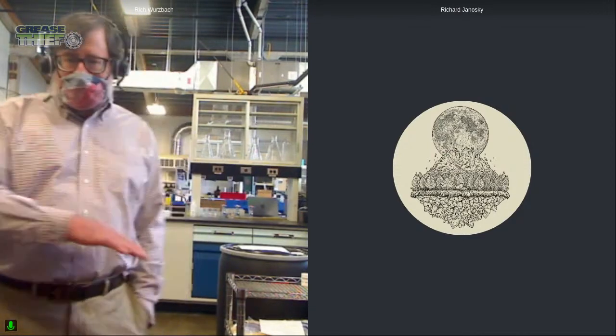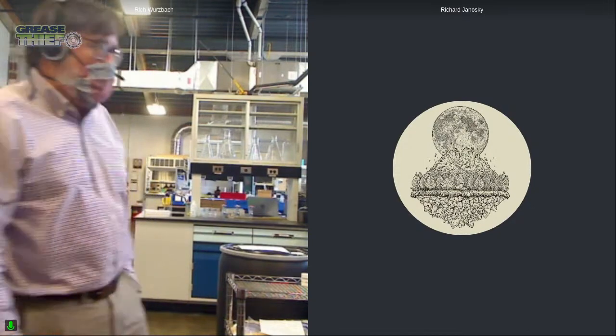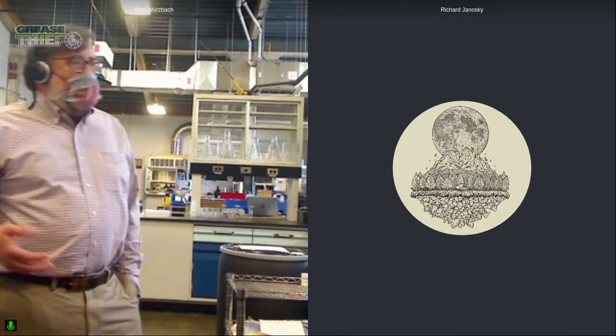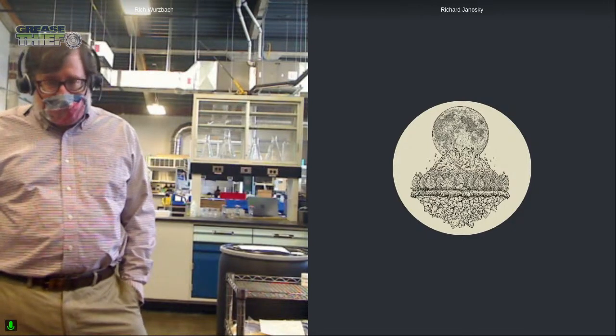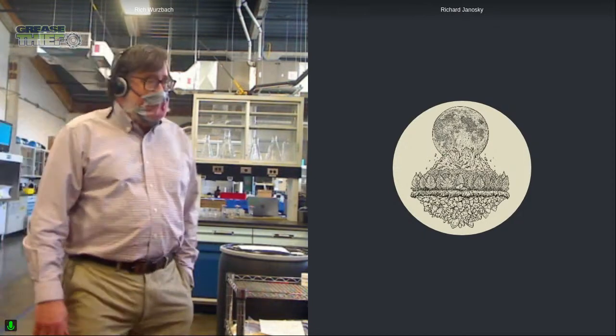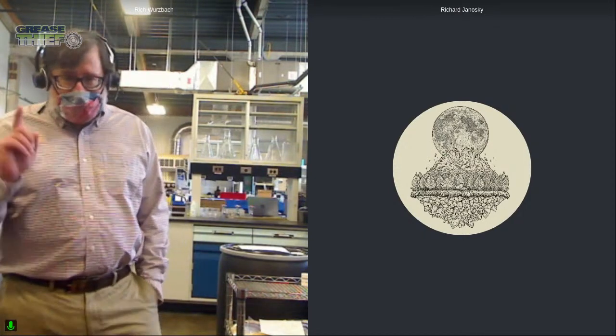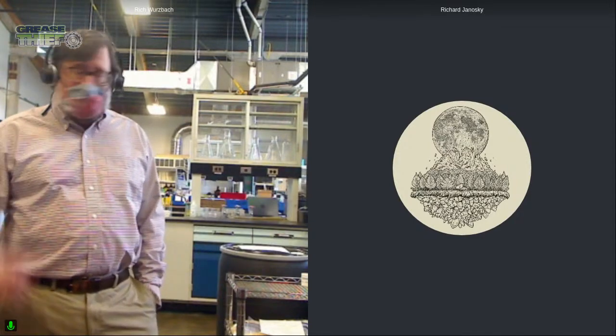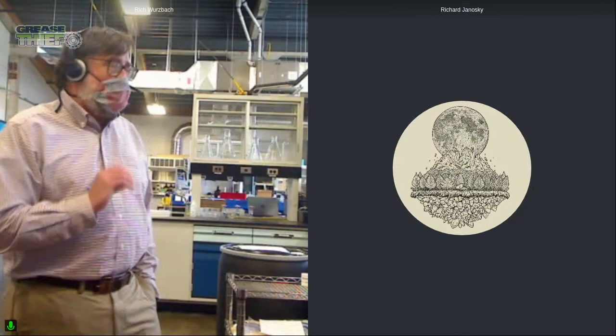You can't go from zero to creating antioxidants in a machine. Therefore, they must have got the labeling wrong. So we came back and said, we think you screwed up the labeling. And the guy very confidently said, nope, I don't think we did. But if we need to, I will take another sample from that machine and send it to you. And sure enough, it had antioxidants and the baseline did not.